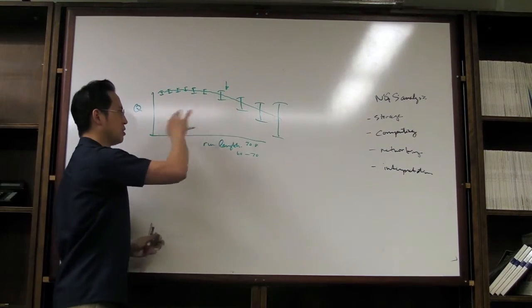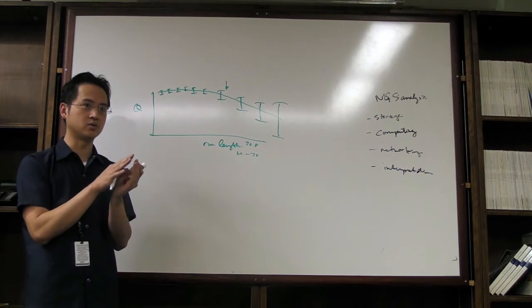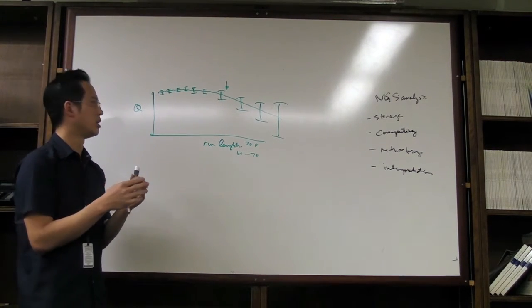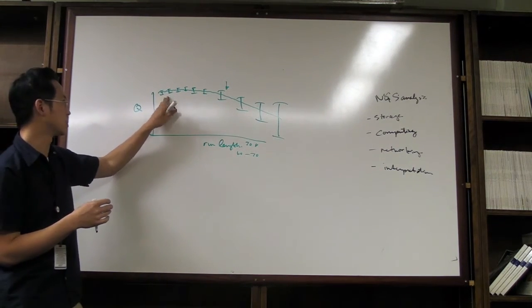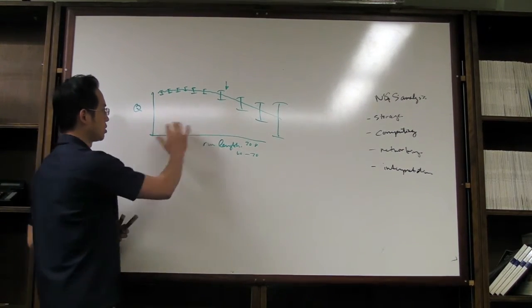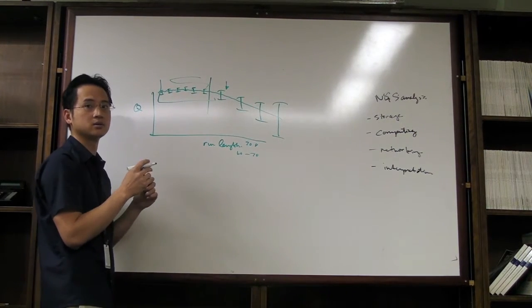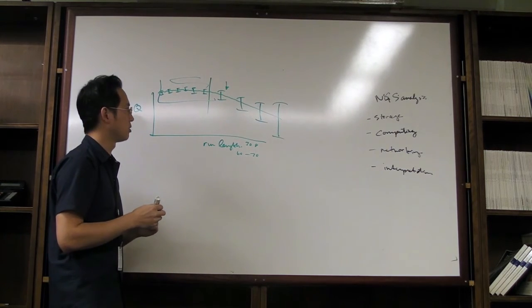And the reason why is as you go longer, there's just more noise, things lag behind, right? You have cluster-based sequencing where not all 1 million molecules are doing the exact same thing every cycle. So you have lagging behind, and that causes noise and error. So it's harder to make an A call here than it is to make an A call over here, because this is so much cleaner and a dark background. This is not, by the time you get all the way there. So the Q scores will vary, and typically if you just cut the first 50 bases, you have pretty accurate sequencing in most cases. When you start dealing with over here, that's when things get a bit more erroneous.